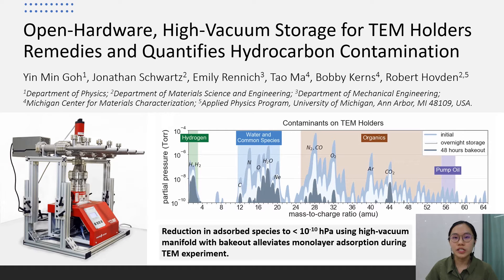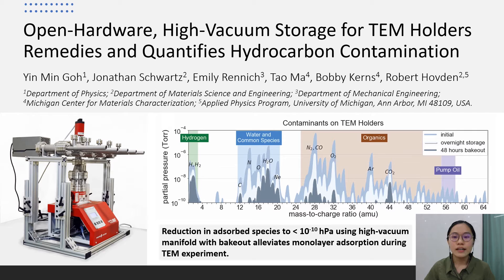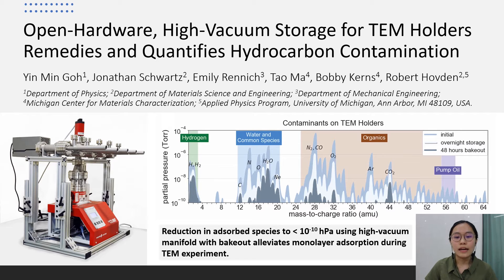Here on the right is a residual gas mass spectrum of a TEM holder commonly stored in a desiccated cabinet. We have carried out similar measurements on several other holders, and they all show that TEM holders are inherently dirty and introduce a range of unwanted species into vacuum. So, we have come up with a high vacuum storage solution that also includes a bake-out system. In this talk, I will show you how this manifold can offer up to four orders of magnitude reduction in adsorbed species on a TEM holder, and helps to alleviate monolayer adsorption during TEM experiments.